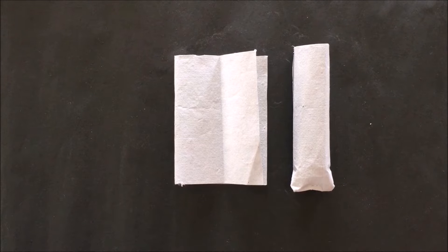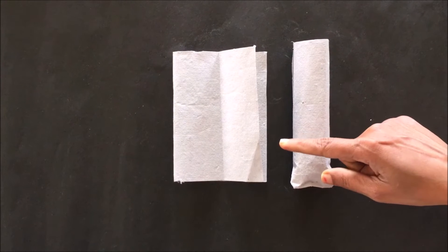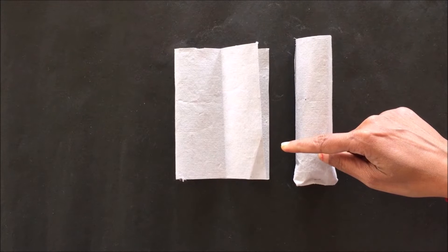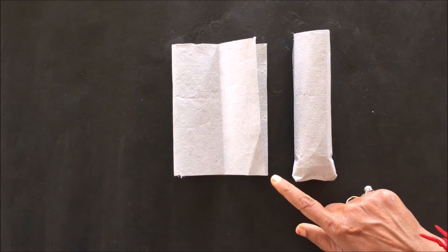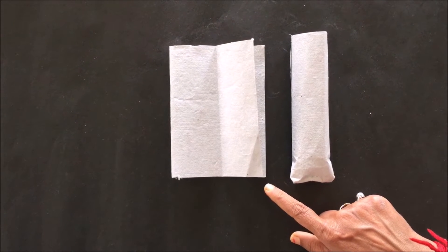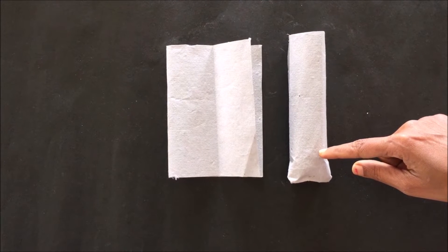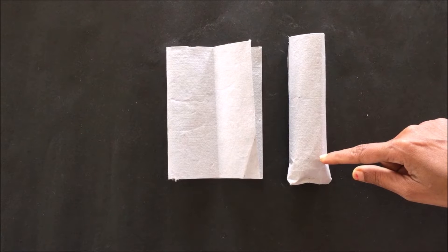The next step is the preparation of the thimble. Here we have prepared a thimble using filter paper. To prepare the thimble, cut the filter paper into a proper size according to the chamber size, roll it, and staple the open end to make it like a pouch. This is the thimble we have already prepared using filter paper.